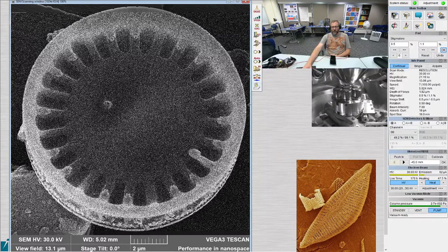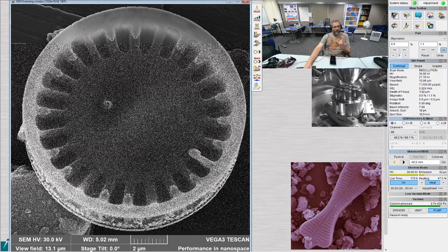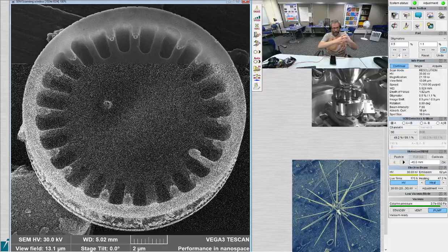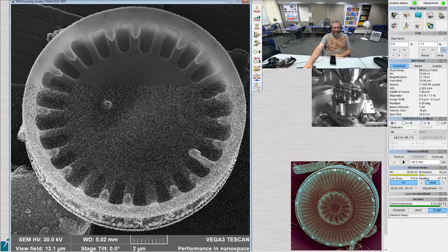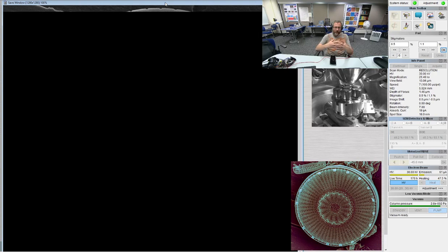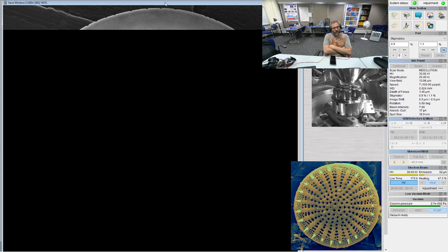You see these little ticks up here? Yeah, little tiny ones. Where the girdle band slides in or something. Those are where the spines from the adjacent cell touch the outside edge, where the spines sit. Are they that big? Normally that's what that mark is. So I'm going to go with yes. It's where the spines from the other valve overlap, basically. The spines usually come through there.